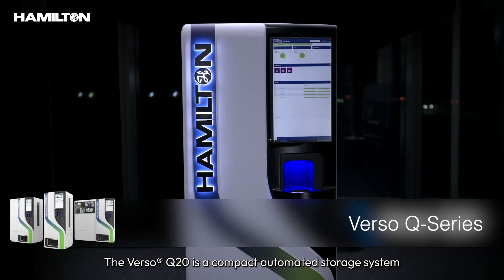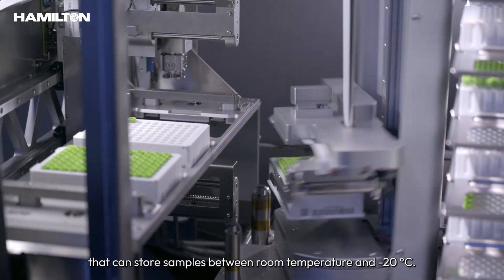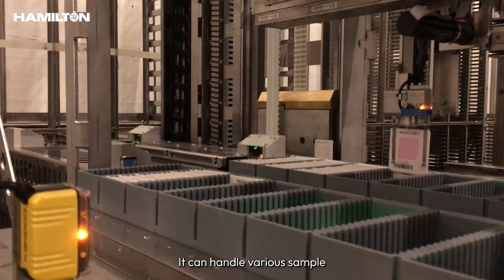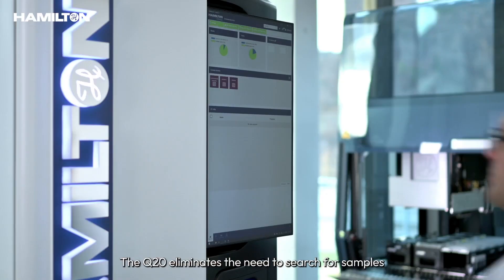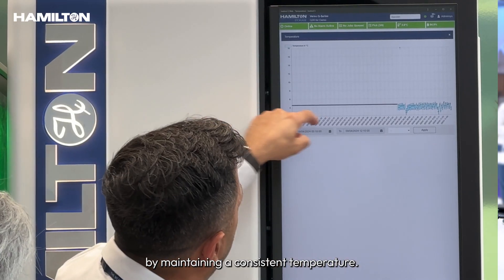The Verso Q20 is a compact automated storage system that can store samples between room temperature and minus 20 degrees Celsius. Despite its small size, it has many features found in larger systems. It can handle various sample configurations and tube plate types, and store and manage almost any SBS format labware.